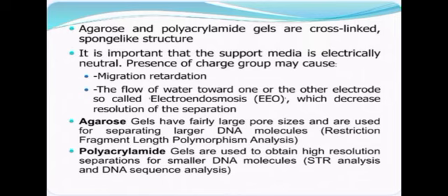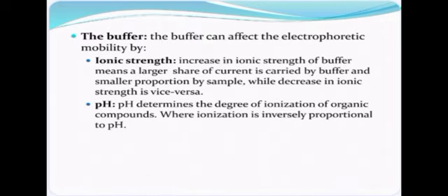In this paragraph we define how the agarose gel and polyacrylamide gels affect the gel electrophoresis. Next, the buffer. These buffer components also affect the gel electrophoresis.